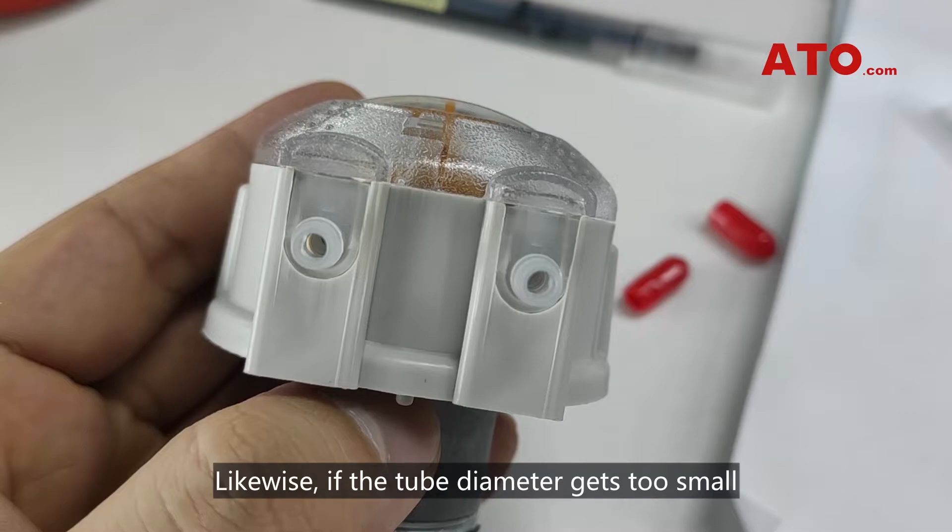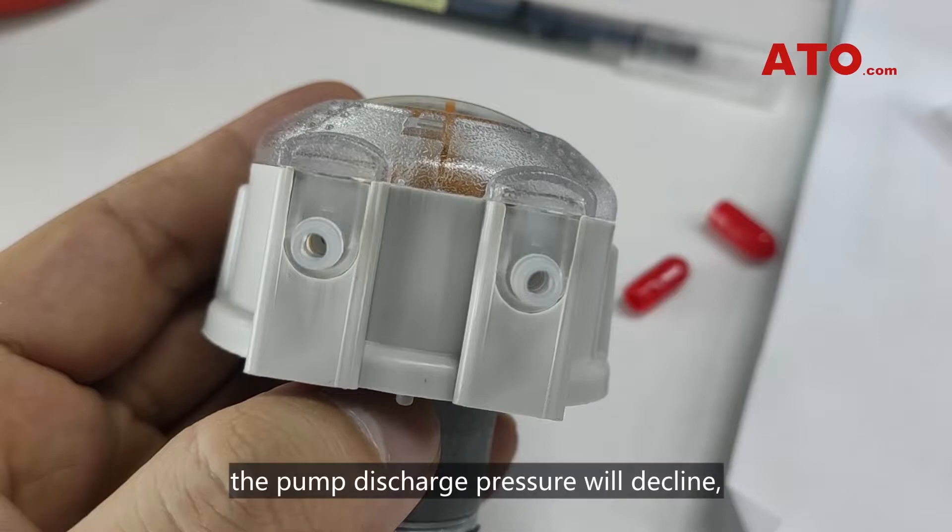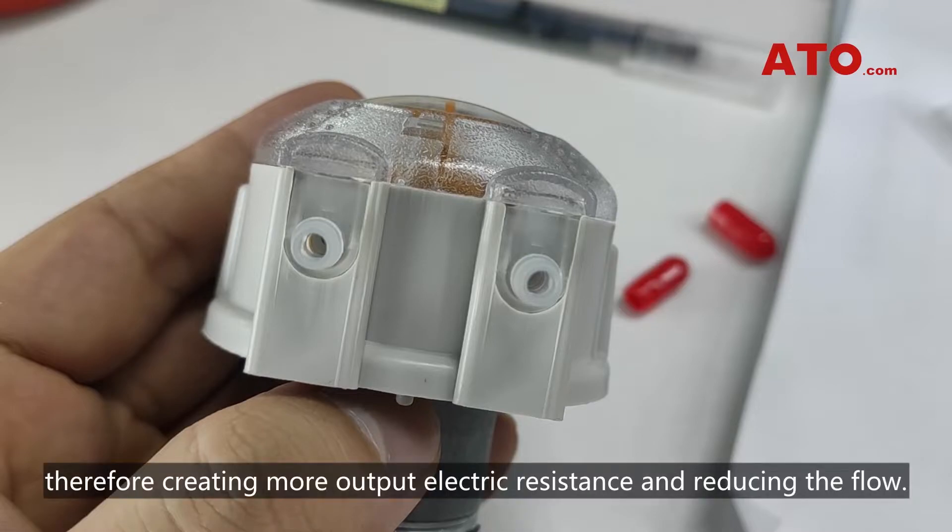Likewise, if the tube diameter gets too small or the passageway is too long at the outlet, the pump discharge pressure will decline, therefore creating more output resistance and reducing the flow.